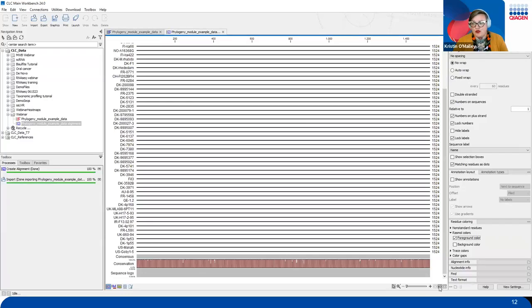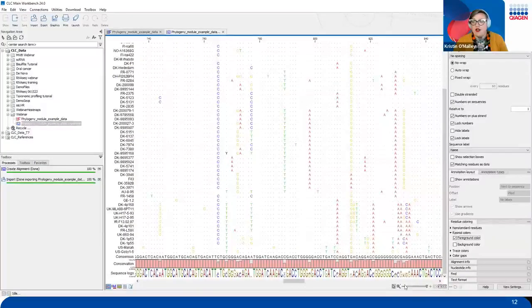Of course, you'll lose your nucleotide level information. So if you wanted to go back to that base level, you can choose to zoom to the base level here. You can also use the magnifying glass to zoom into an area of interest, or the slider to increase or decrease how deep you're going into the sequence here.